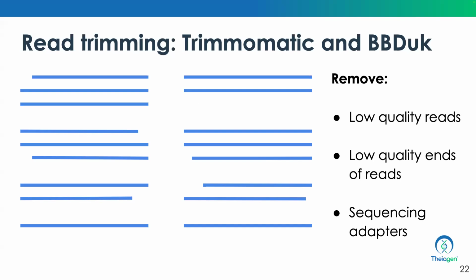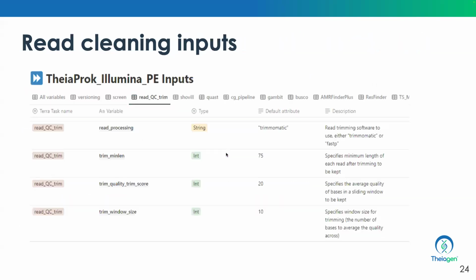So let's say you expect a Phred score of 30 and above, and maybe let's say your minimum read length is 70, you're getting to 69 or 70, but the read still does not have a mean Phred quality score of 30 and above. So typically, this is what you would expect of your reads after the read cleaning step.